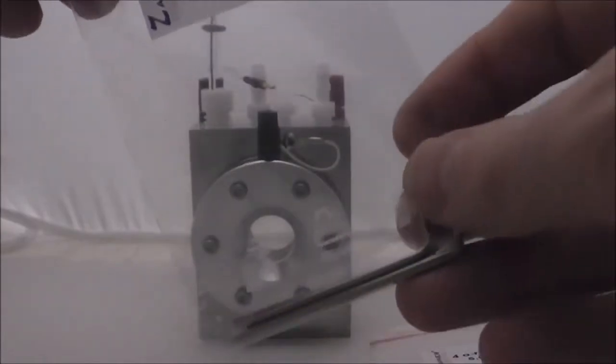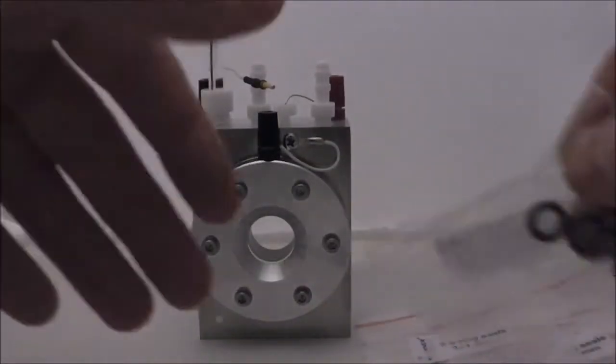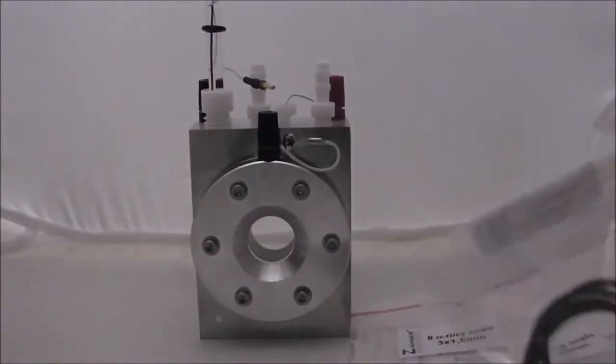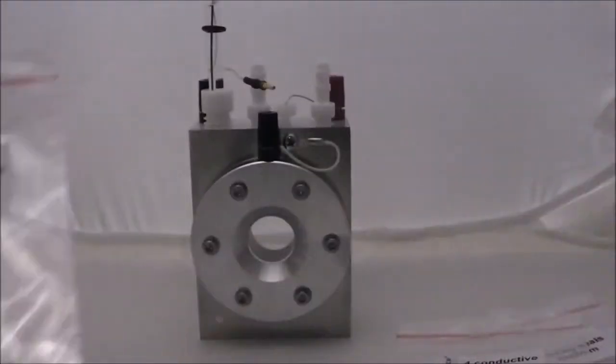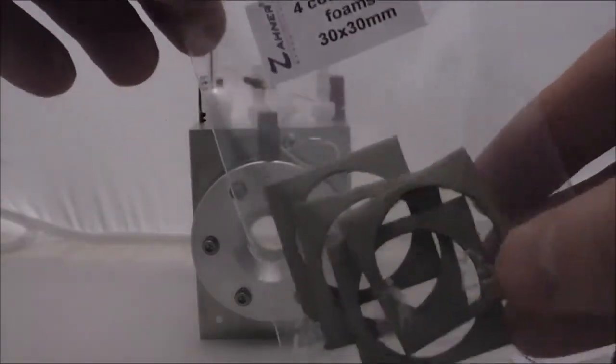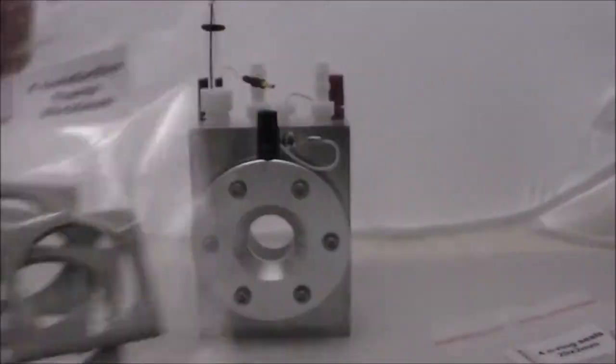You get the hex keys or Allen keys that you require, and all the seals that are necessary. It's not just one of each seal sent. They send a whole series of conductive foams used in the cell as well.